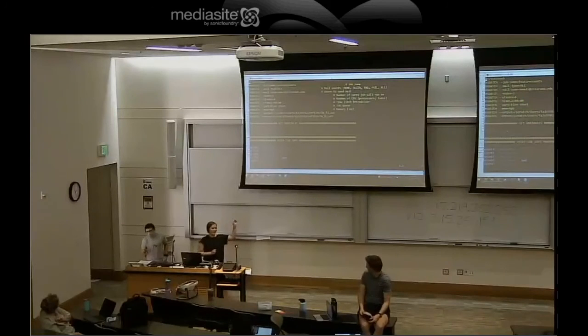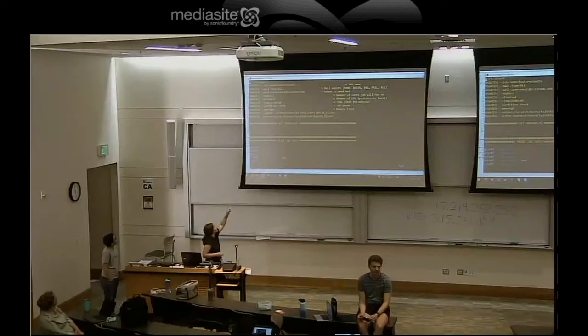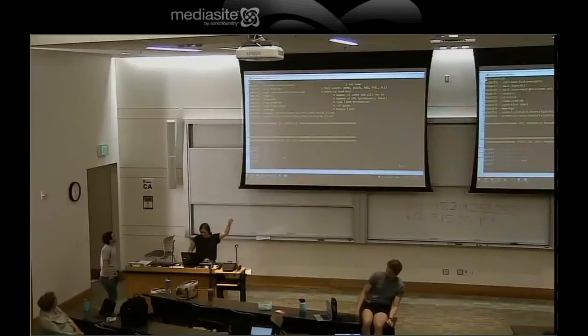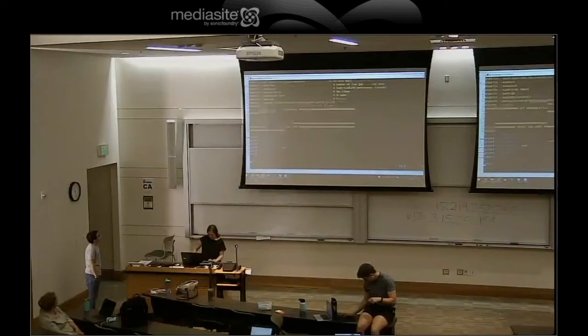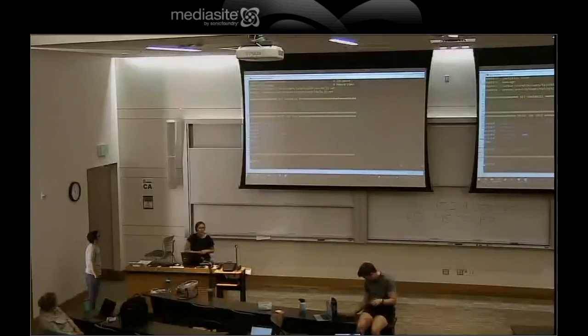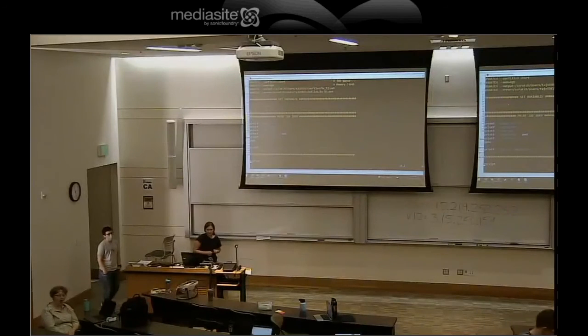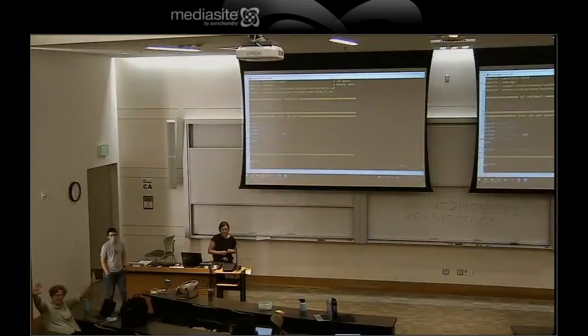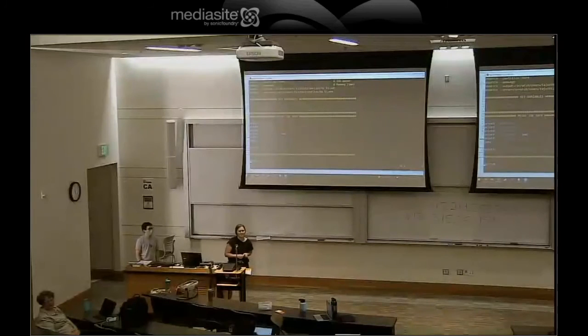All right, guys, so, as was just said, for submitting sbatch for your feature counts, this is how we'll do it. You have an sbatch script that you guys are familiar with, and then we're calling in our script, feature counts, and then it will run it as an R script. Does that make sense? So you have an R script and an sbatch script. The sbatch script will run the R script. So you do all your editing in that R script, and then you just submit it out to the computer.